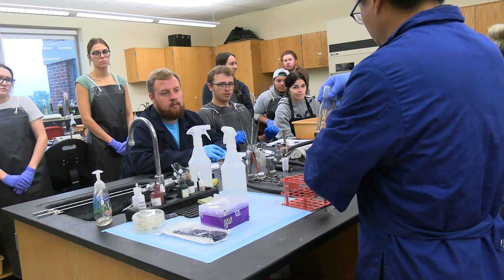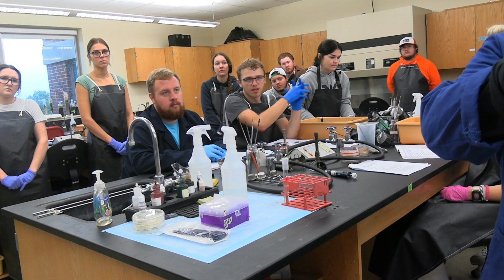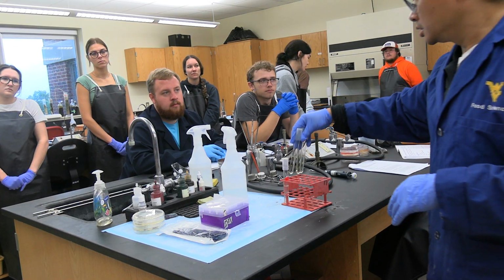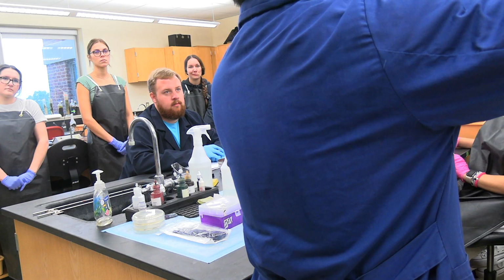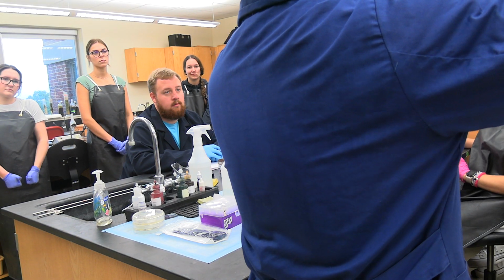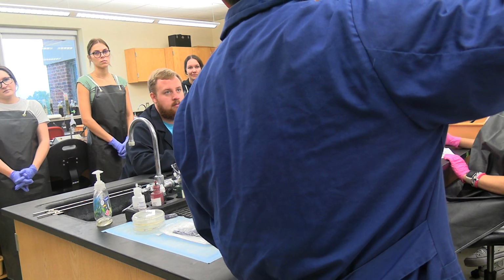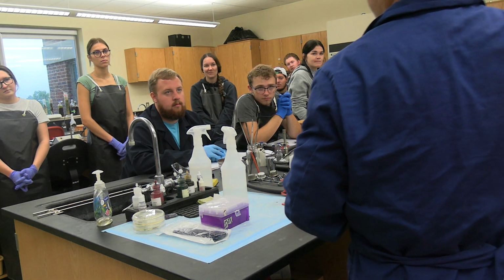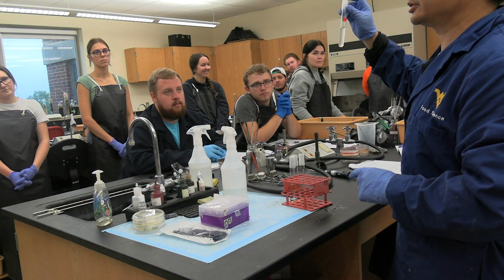Okay, and all these used dilution tubes are trash. So give to Rion. Very important, this one returns to the front desk, and don't contaminate it. Otherwise, the E. coli is no longer E. coli by the end of the day. It's mixed with everything. Then you will see maybe yellow, red colonies in some of the plates.